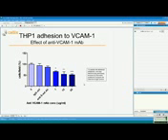First, we looked at THP1 cell adhesion to the most common adhesion molecule observed in inflammation, VCAM1. In this case, we've chosen to look at the effects of the antibodies on the cell adhesion. So what we do is we coat the channels with VCAM1 and then subsequently block the channel with anti-VCAM1 monoclonal antibody. Also, we use an IgG control as a reference and anti-selectin antibody as well as no treatment.